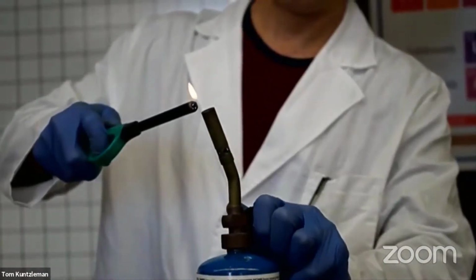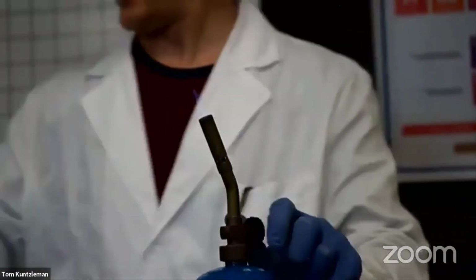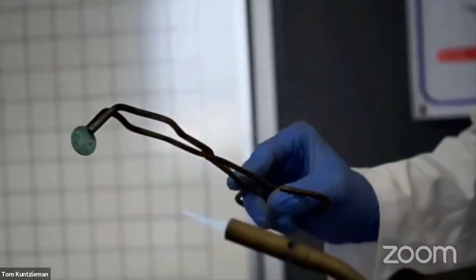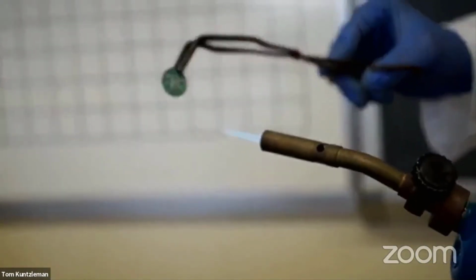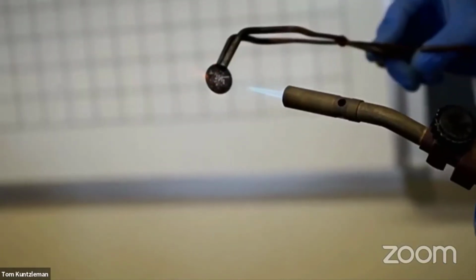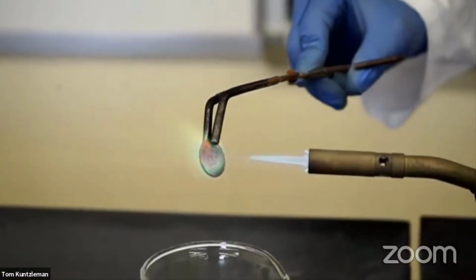Come on. Every once in a while, it gets a little tricky to get this thing lit. There it goes. All right, here we go. It's a great question. I'm so excited to find out what's going to happen. I've never done this before. Did you see that little flash of green? Going orange, kind of got black, didn't it? Well, I better be careful. Look at that green. Oh, that's gorgeous.